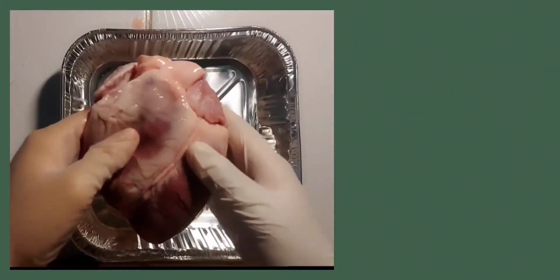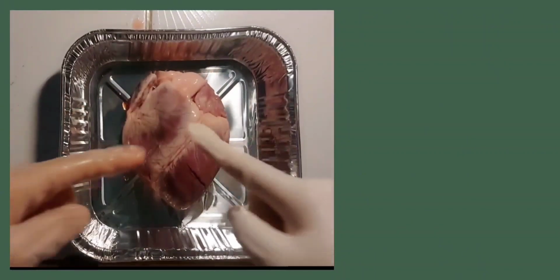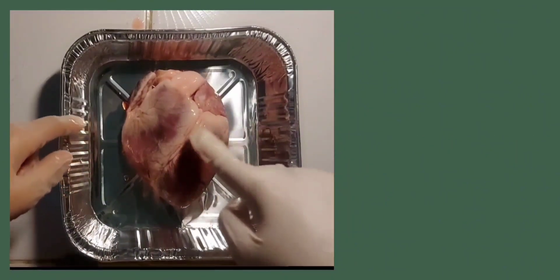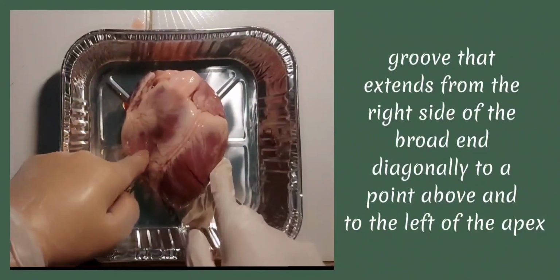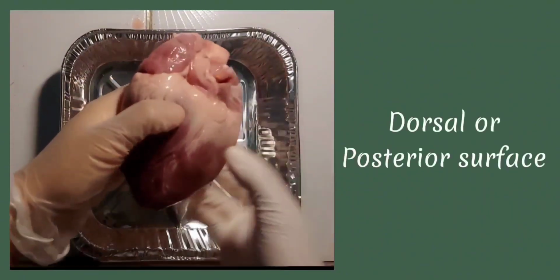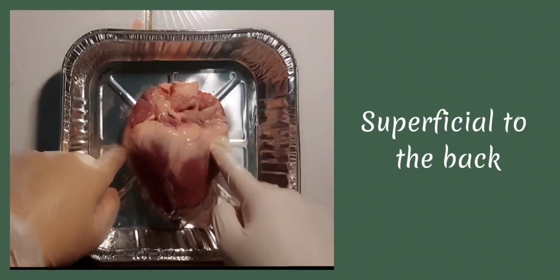First, let us examine the orientation and external structure of the heart. This surface is the ventral or anterior view of the heart. That means it is superficial to the chest. You can also recognize this by the groove that extends from the right side of the broad end diagonally to a point above and to the left of the apex. And then this surface right here is the dorsal or posterior view of the heart. That means it is superficial to the back.